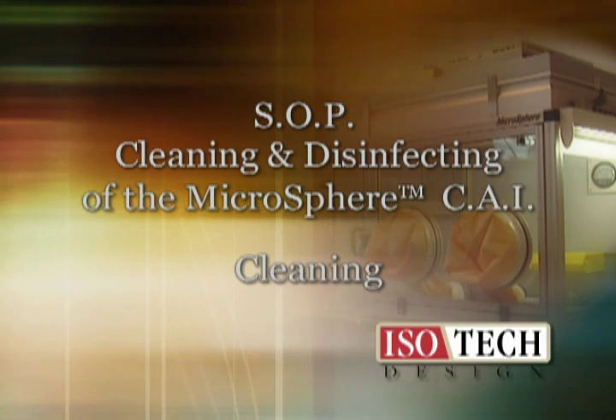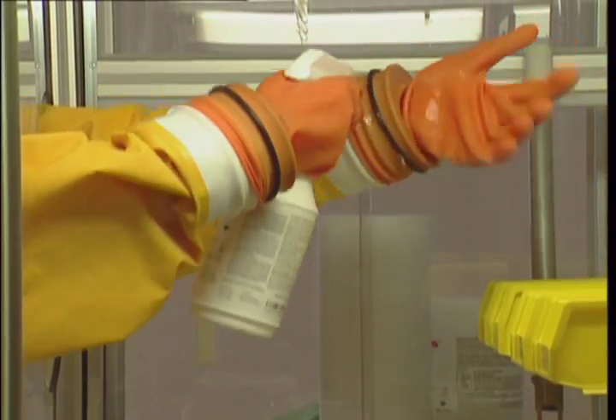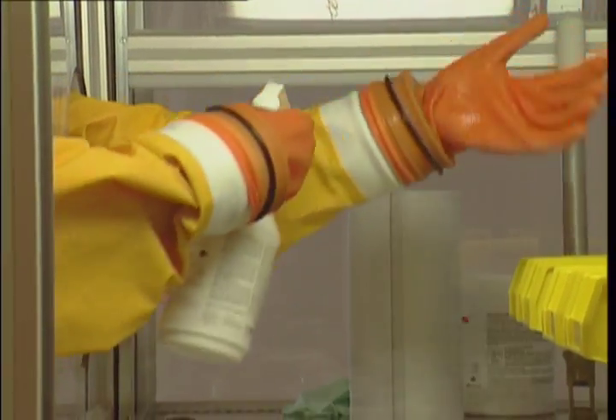Cleaning. Clean the sleeves, the wrist rings, and the gloves.